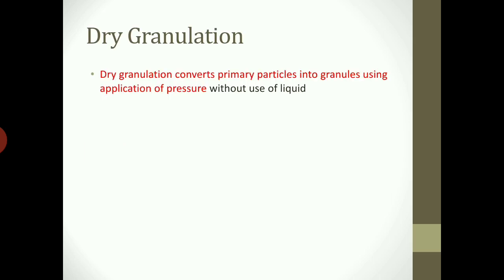Hello, now we will go through dry granulation and direct compression. Dry granulation converts primary particles into granules using the application of pressure without the use of liquid. As no liquid is involved in this technique, this process is called dry granulation.